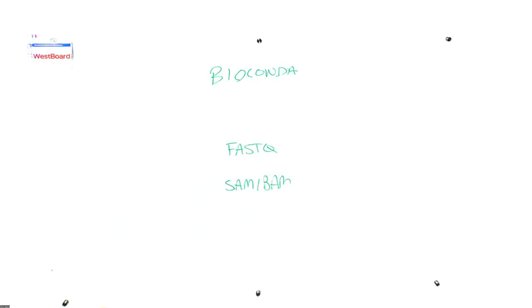And there's reviews in here about how those are organized. In essence, on a summary level, they're row-based systems where each row corresponds to a different read or piece of information, or in the case of SAM-BAM, an alignment to a reference genome.